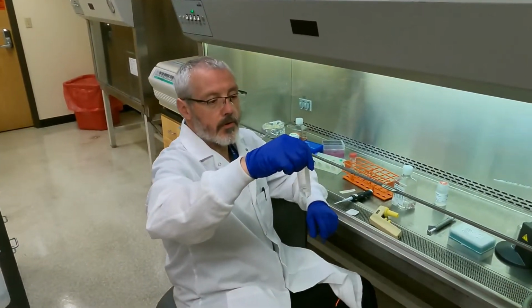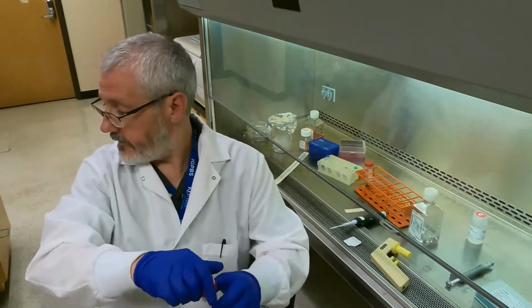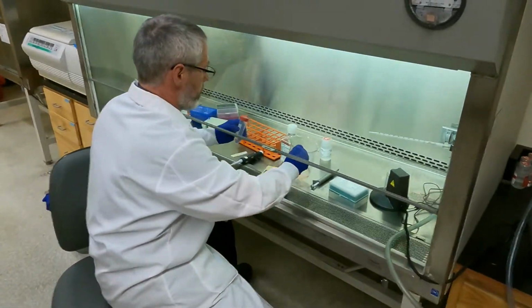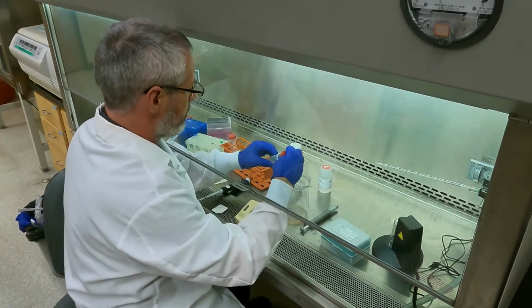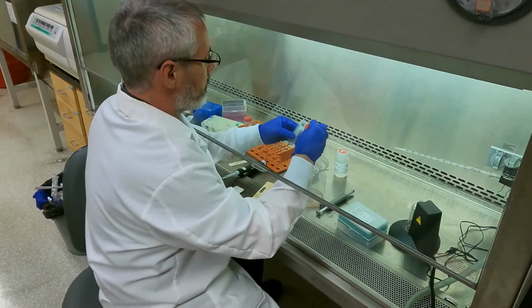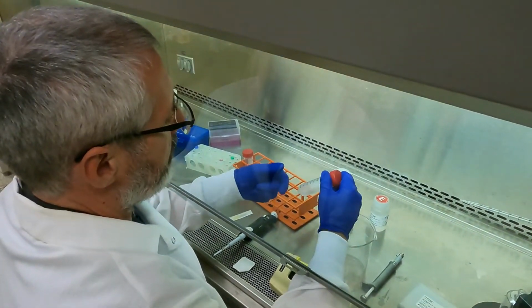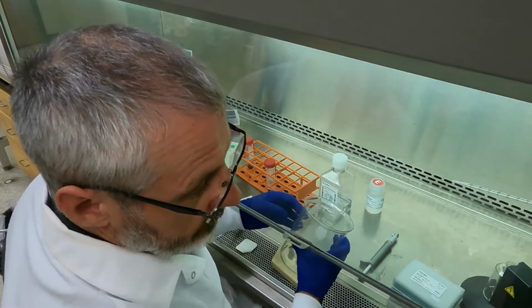Right, so what we're going to do here is rescue these cells again. I'm just going to tip off the PBS, and then I'm going to take it up in 5 mils, which will double the cell concentration. And the washing with PBS seems to reduce the amount of nucleases around, makes a better electroporation, more efficient.